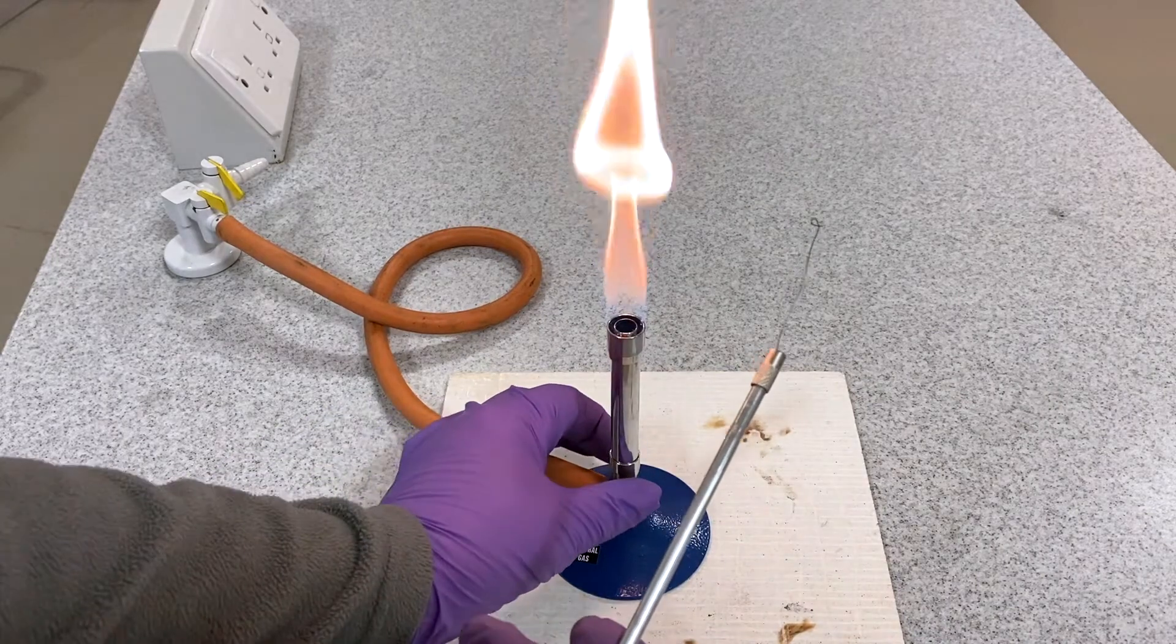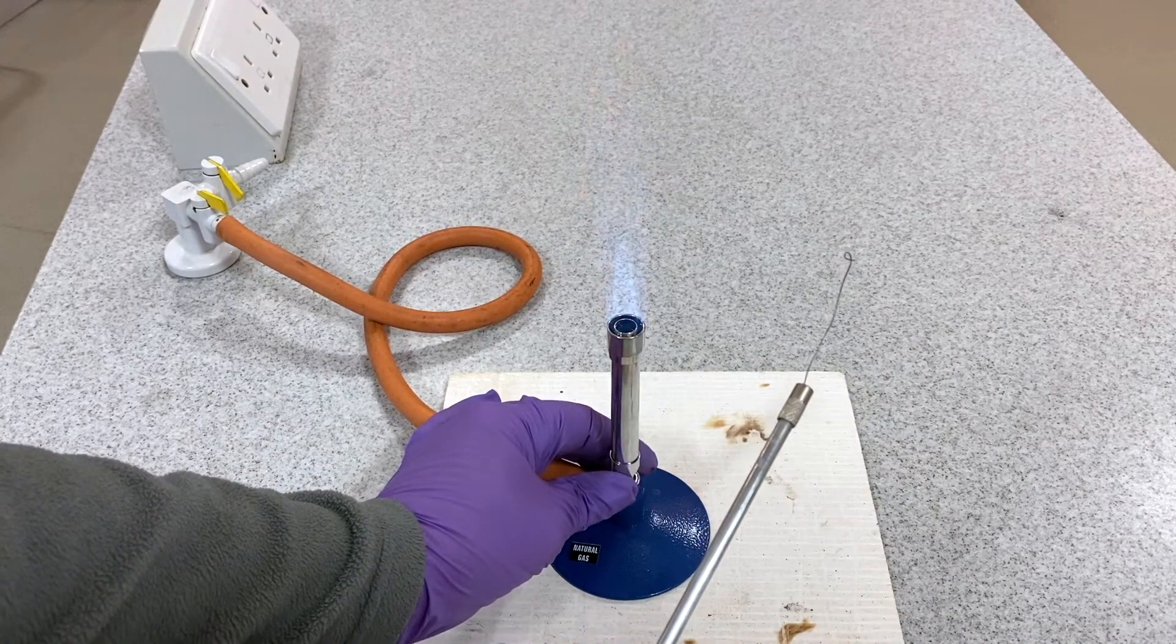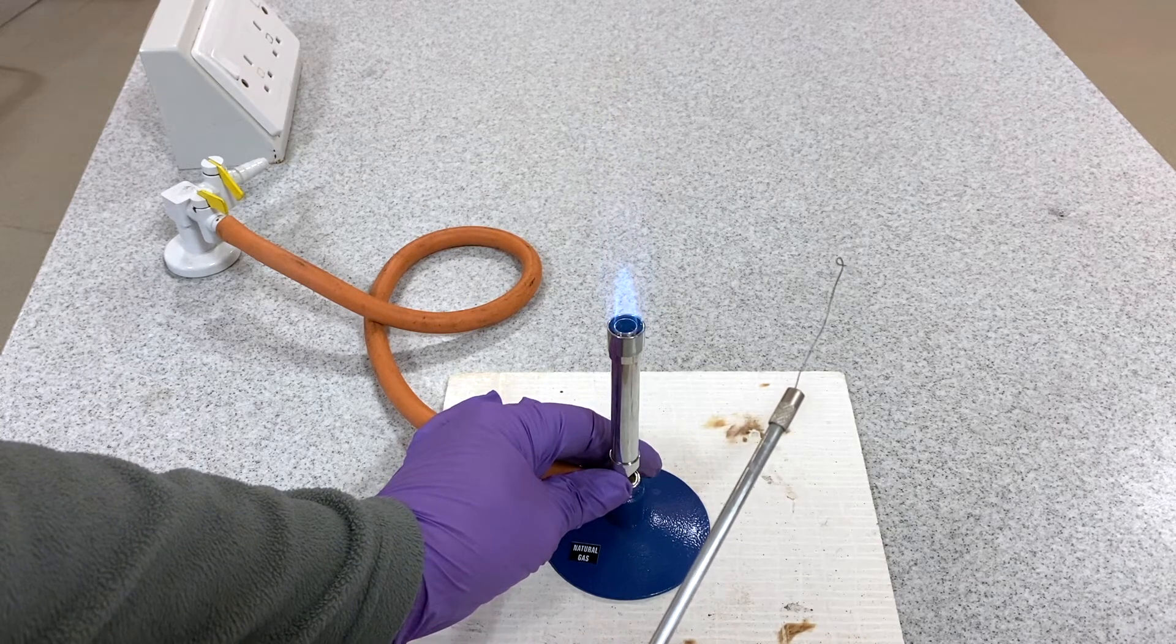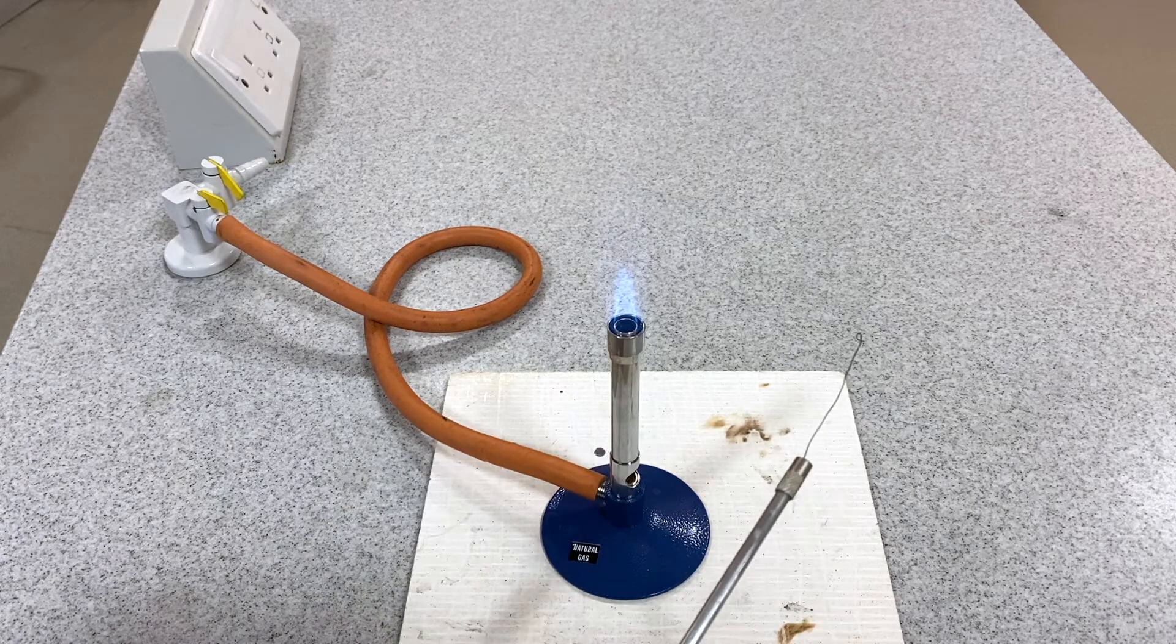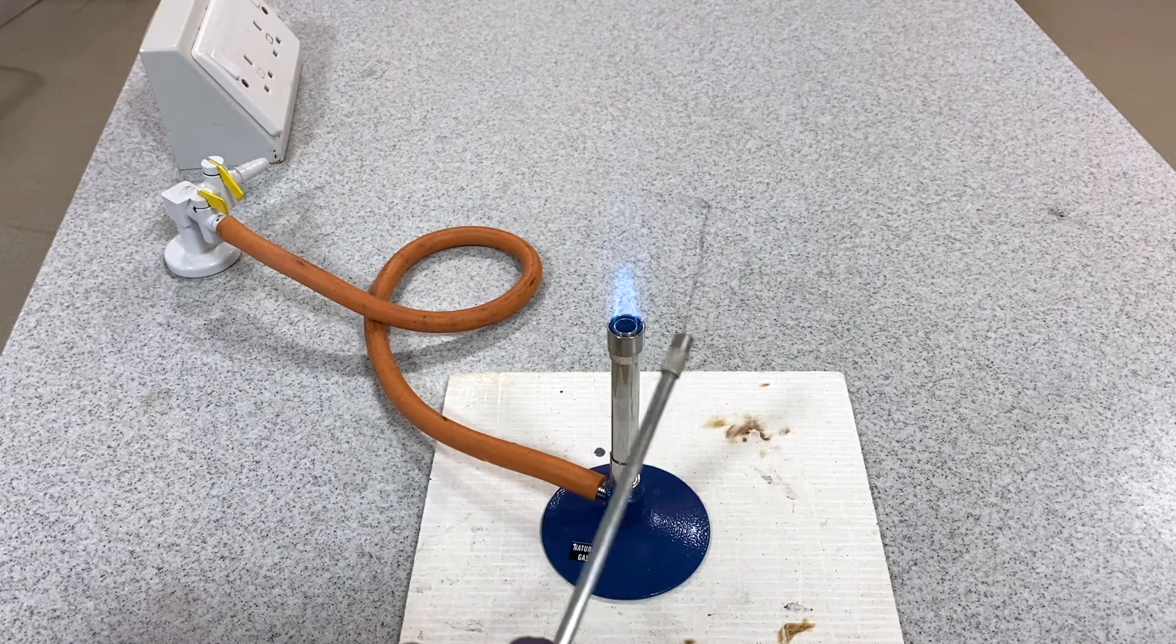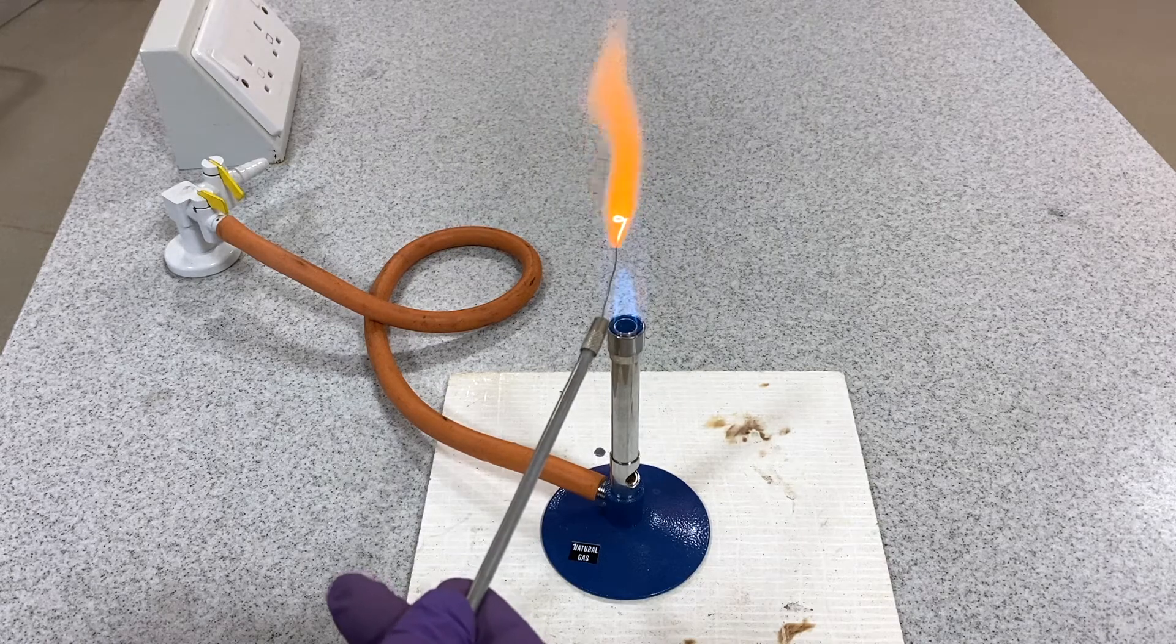The petri dish with the agar medium can be used to create a streak plate. A streak plate is created when a bacteria sample is placed onto a wire loop and streaked across the surface of the agar. To sterilize this wire loop, it is passed through a hot Bunsen flame.